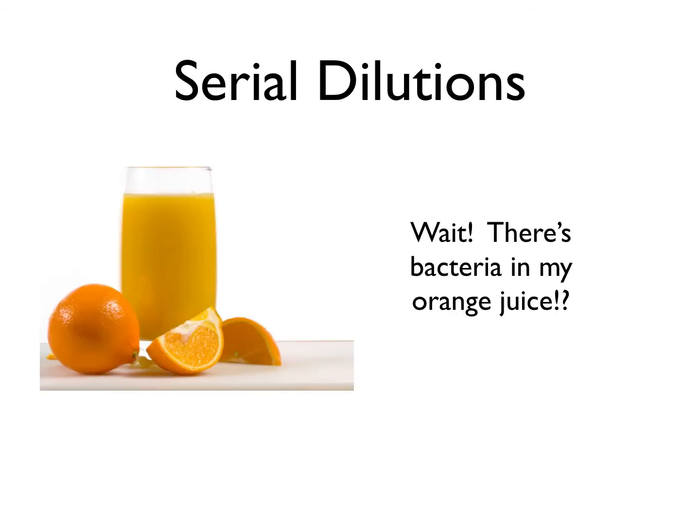Imagine that you're a microbiologist who's been hired to determine the species of bacteria responsible for contaminating the supply of Florida orange juice. To begin, you need to determine the total number of bacteria in the juice. So you take a sample of juice and pour it directly onto a tryptic soy agar plate. After 24 hours of incubation, however, you examine the plate only to discover that a lawn of bacterial growth has formed, making it impossible to isolate individual colonies.